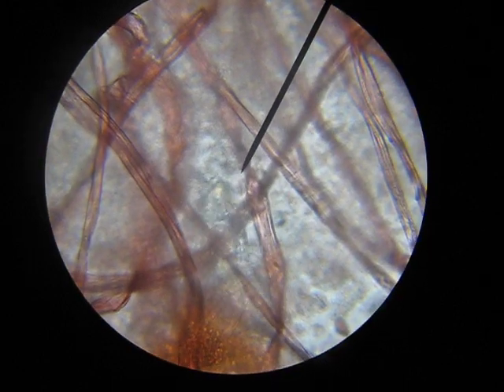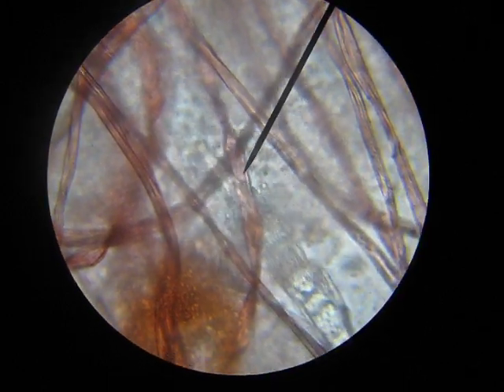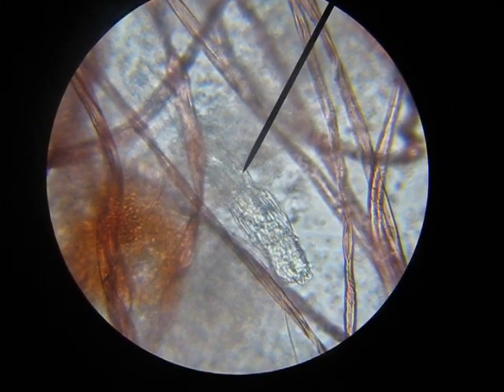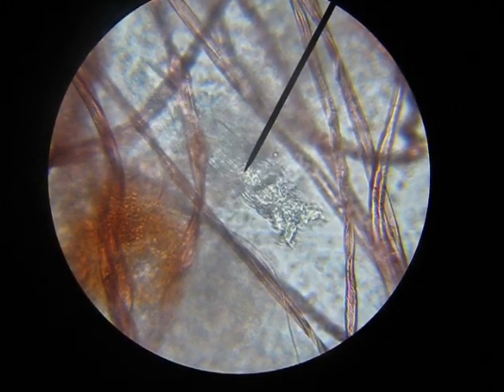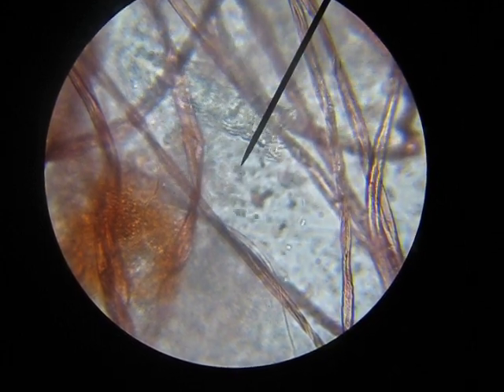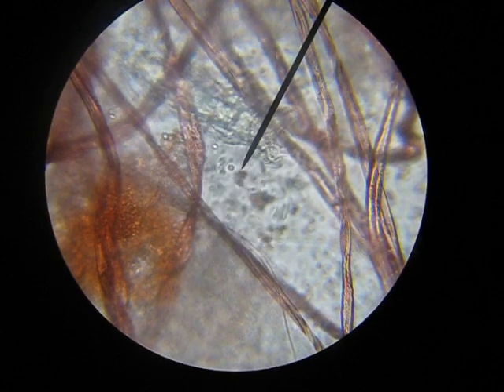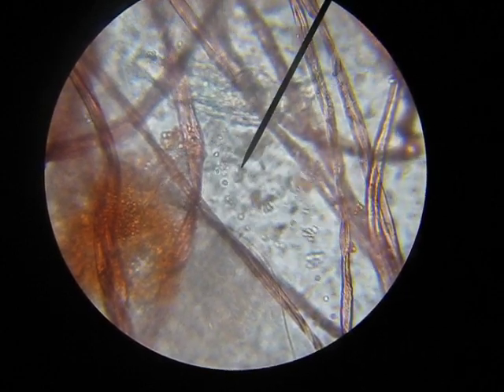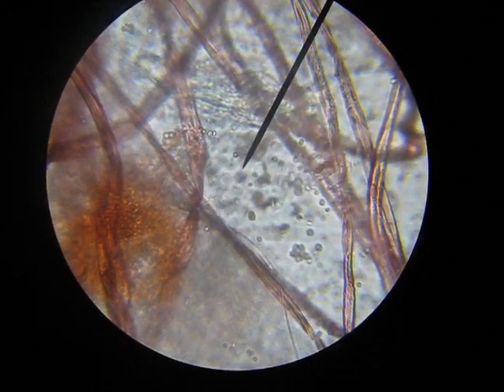Because we should be able to see... There. Oh, that's a good view right there. Okay, there we go. Look at that. I think that's eliminating waste. See how it's just pouring out? Yeah. And look, the stuff on the side — it's moving so quickly. All the stuff around it.